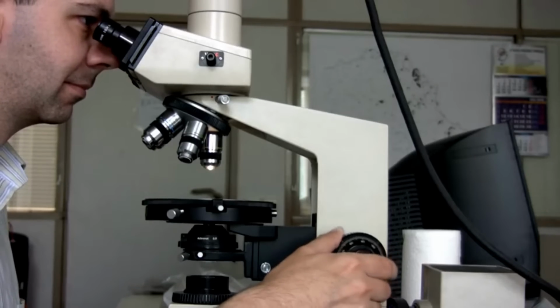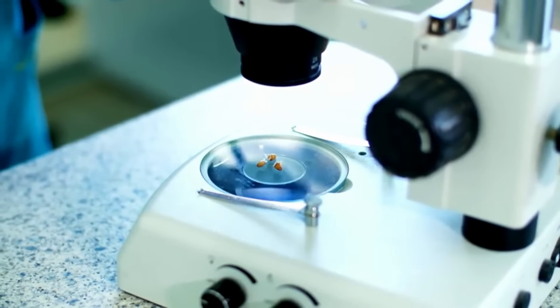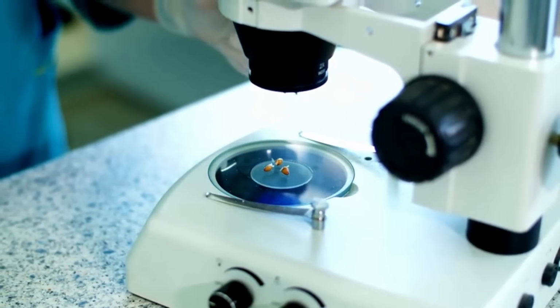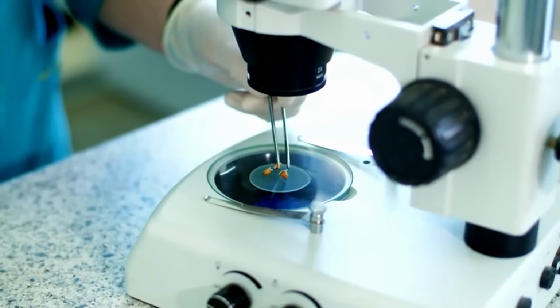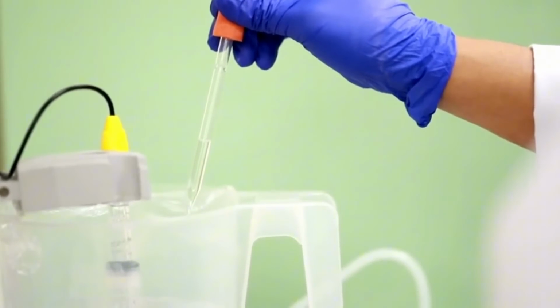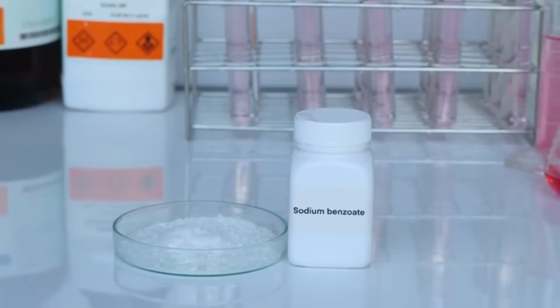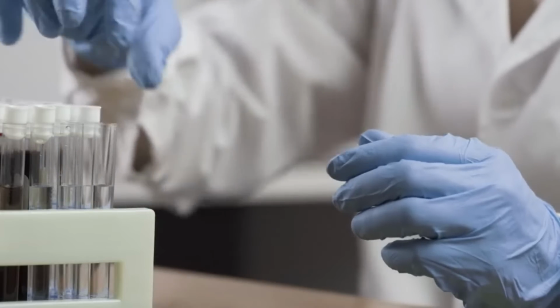Phase contrast microscopy uses interferometry to enhance contrast of transparent or living specimens. For bacteria, parasitology, semen analysis. Fluorescence microscope detects fluorescent dye-stained structures when illuminated by specific light wavelengths. Vital for research like immunofluorescence and molecular techniques.